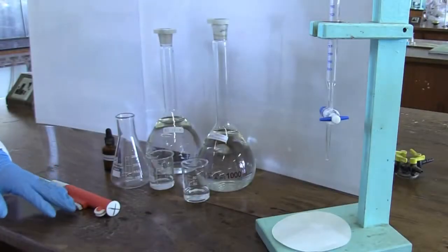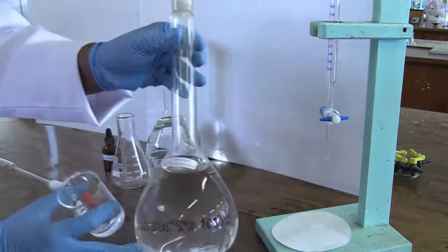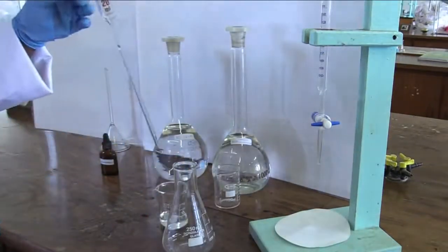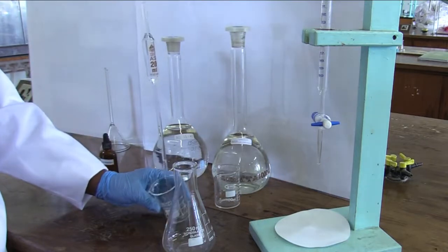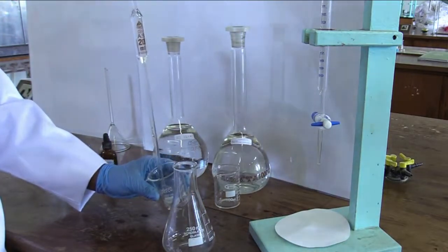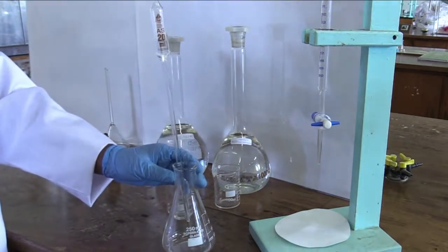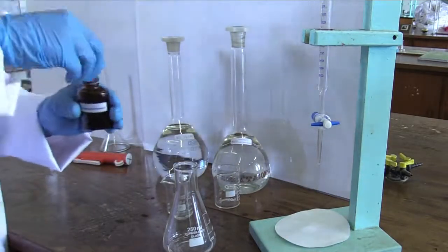So in preparation for the titration, we need to decant the base, our analyte, into a beaker to transfer it into the burette. We will read the initial volume and use this to find the volume that is reacting. We decanted some of our acid, our standard solution, into a beaker so that we could use our pipette to measure a set volume of 20 ml. The meniscus needs to be at the level to ensure the accuracy of the volume reading. We then place the solution into the Erlenmeyer flask where we will carry out the titration. We are almost ready to titrate.